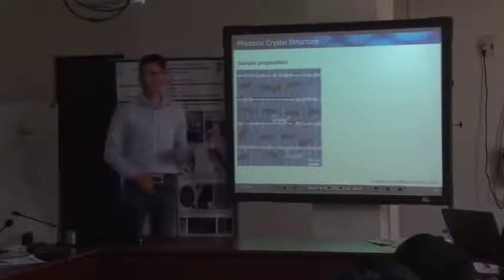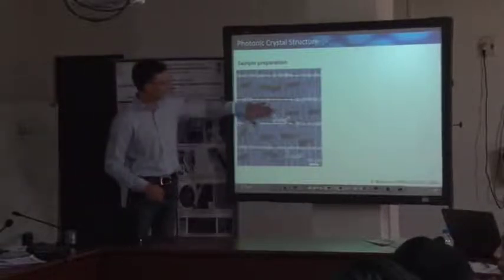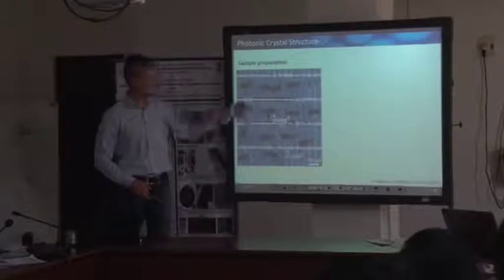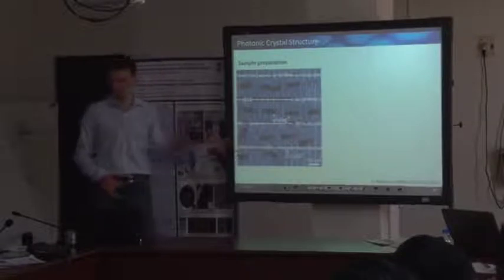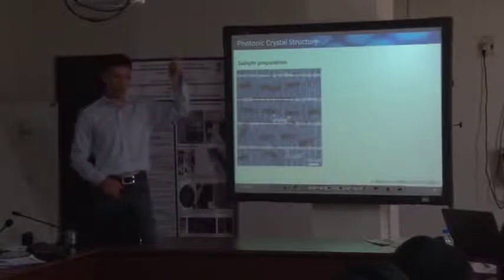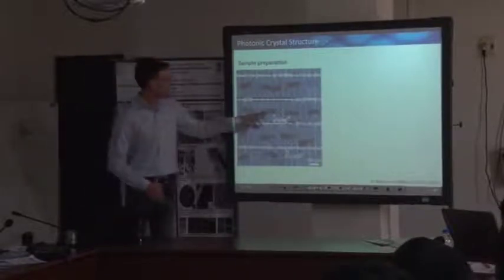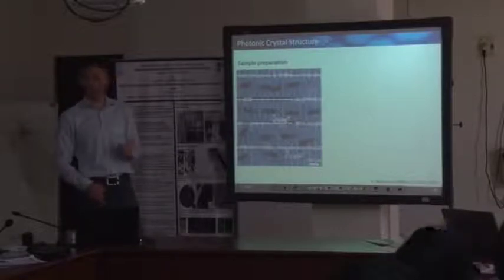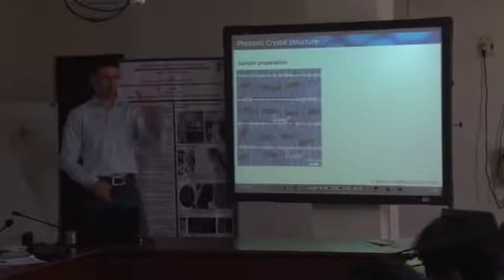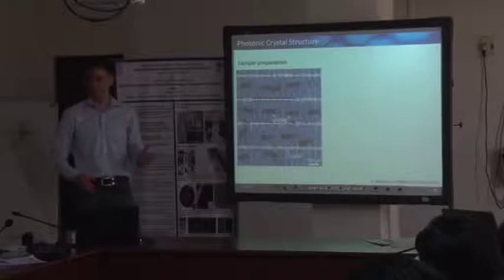But you will see that we had to do some TEM sample preparation using the focused ion beam. Because you can easily imagine that if you tilt the sample, and those are already 3 micrometers, although they exhibit a certain porosity, 3 micrometers is very thick. In the worst case, the electron beam would have to propagate through 3 micrometers of chitin. And if you tilt up to, let's say, 70 degrees, the path would be longer by a factor of probably 2.5 or so. That would be like 5, 6, 7 micrometers. Okay? And this is an extremely thick sample.